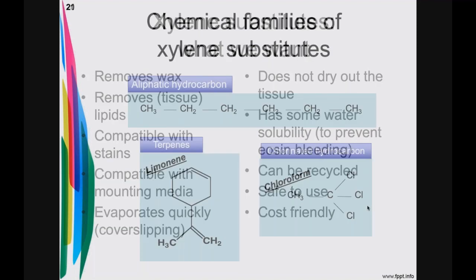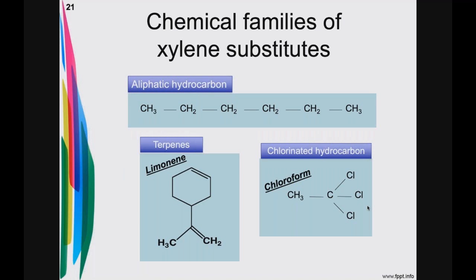Let it be safe to use health-wise. And let it be cheap. You can't afford... sometimes people do not pay for safety. So what are the chemical option families that we have for xylene substitutes?